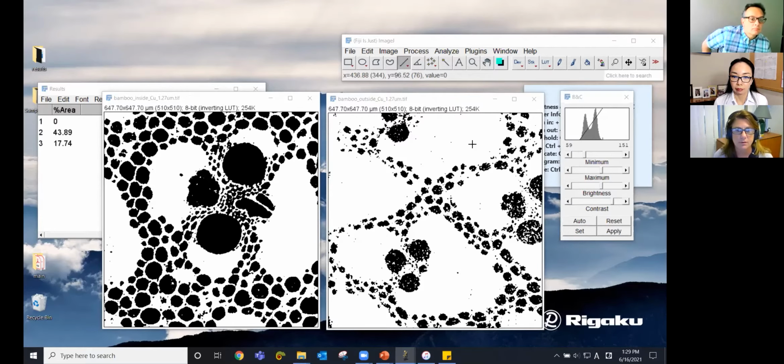So quite a few votes coming in. We'll wait a couple more seconds for this, and then I'll end the polling and I'll share the results with everyone. So I'm going to end it in 3, 2, 1 and share the results. And the winner in this case was, we can't tell without checking Analyze, Set Scale. Okay, so let's take a look.